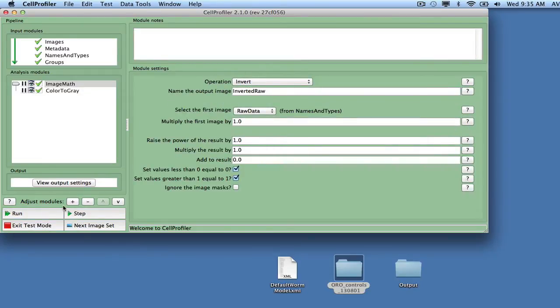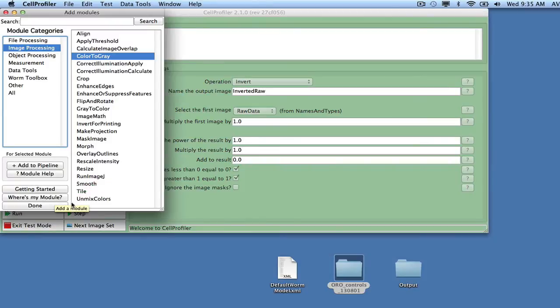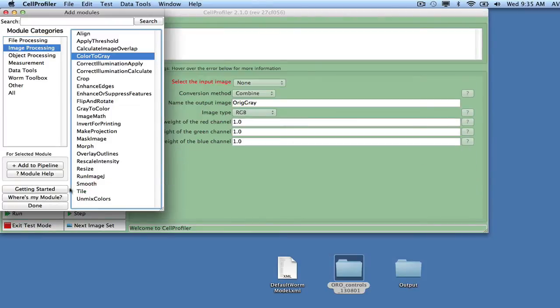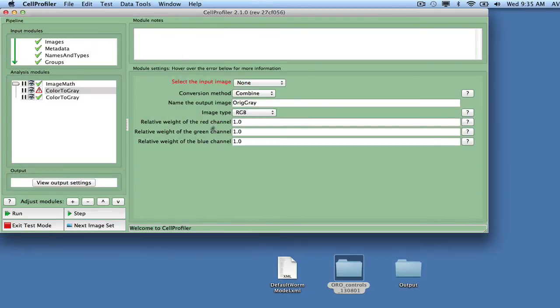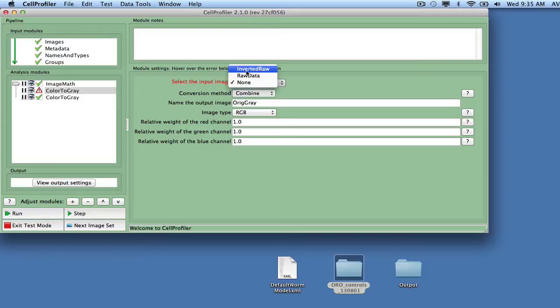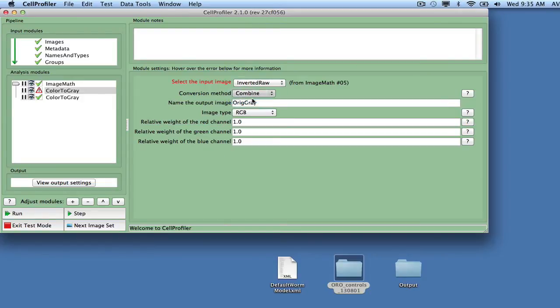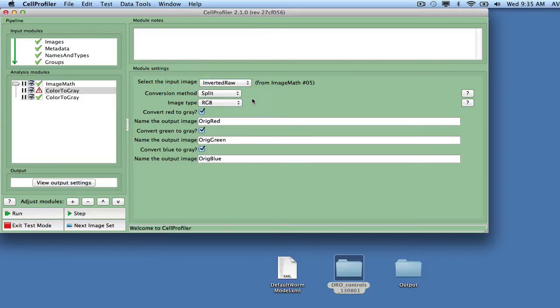Add another Color to Gray module, and this time split the red, green, and blue channels, and call them OrigRed, OrigGreen, and OrigBlue. These images will be used for identification of bubbles and fatty regions.